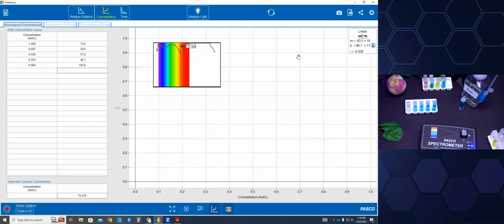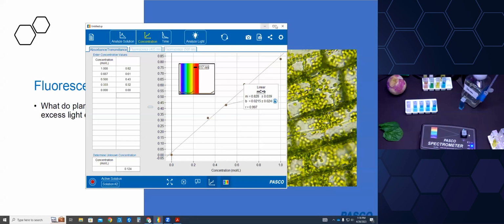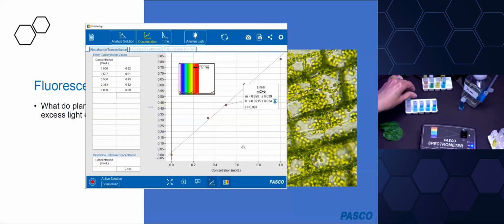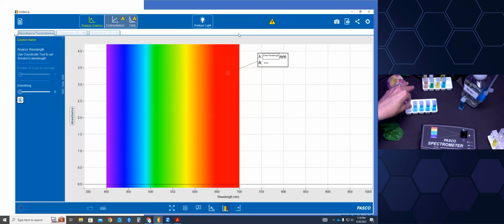Okay. All right, well, I'm going to close and reopen. When in doubt, close and reopen. And that's okay. Luckily, this was quick to get data. We definitely want to see what's on that y-axis so that we can do kinetics, right? So let's restart, reconnect.